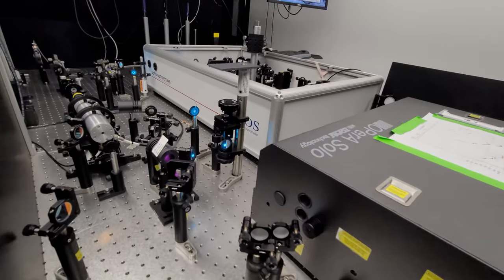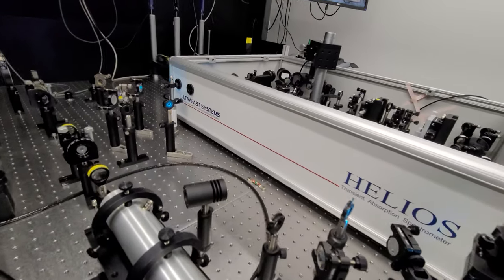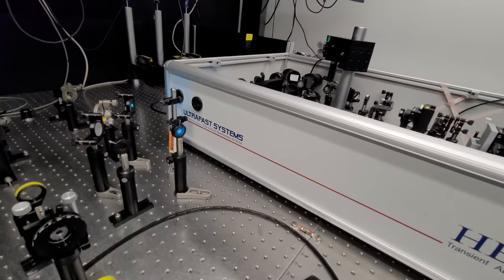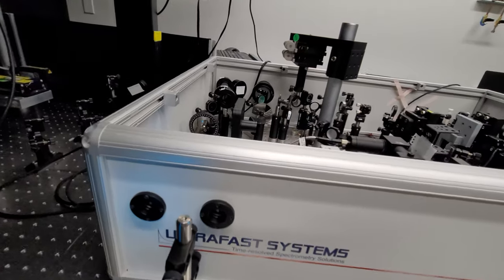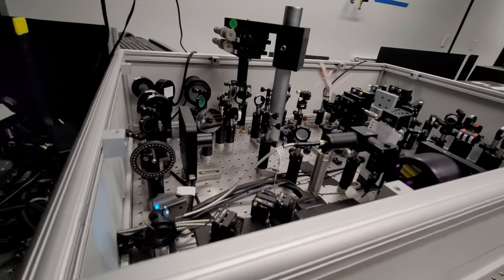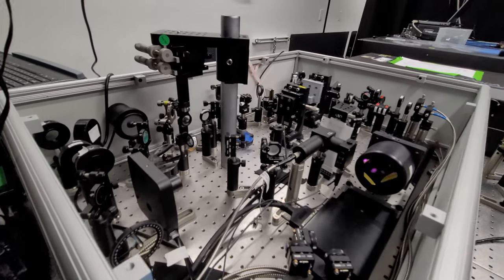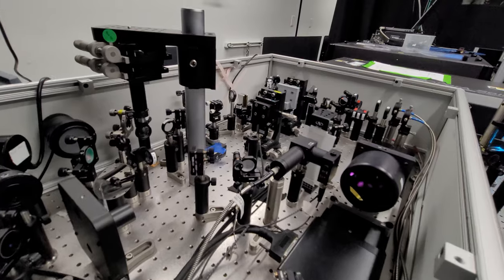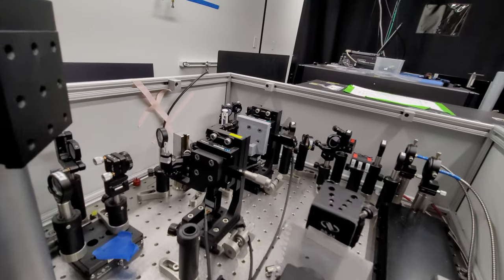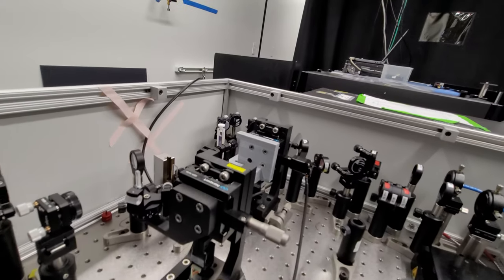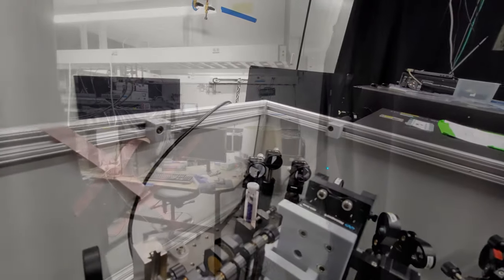In many metal oxide materials, the initial populations begin losing energy within a few picoseconds, a trillionth of a second, and can be fully relaxed by a few microseconds, a millionth of a second. As chemical reactions in solution tend to occur on the millisecond timescale, a thousandth of a second, there can be upwards of nine orders of magnitude in mismatched kinetics which represent significant efficiency losses for converting sunlight into chemical fuels. Therefore, using experiments like transient absorption can help us understand how to improve photocarrier lifetimes by reducing or mitigating unwanted reaction pathways.